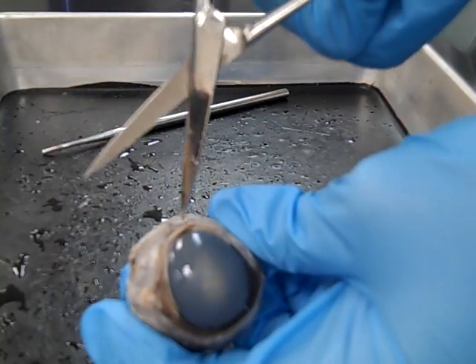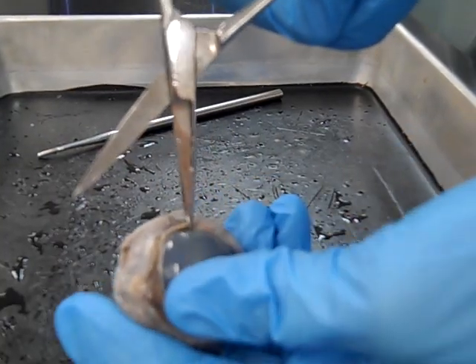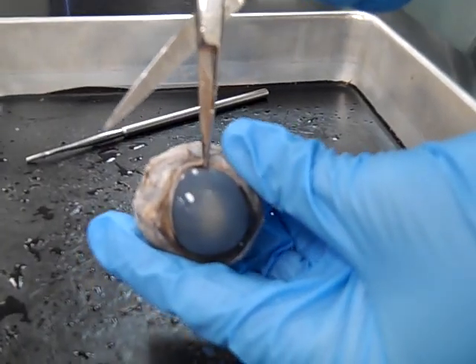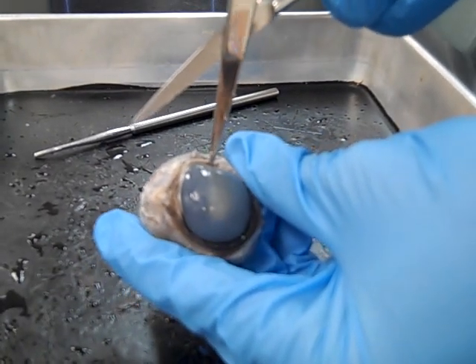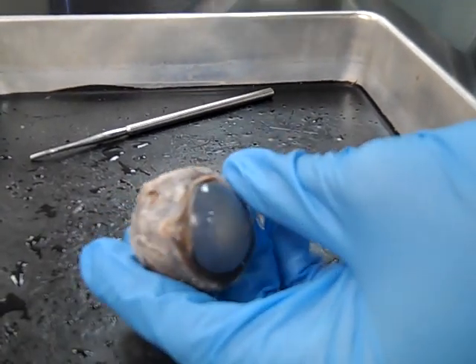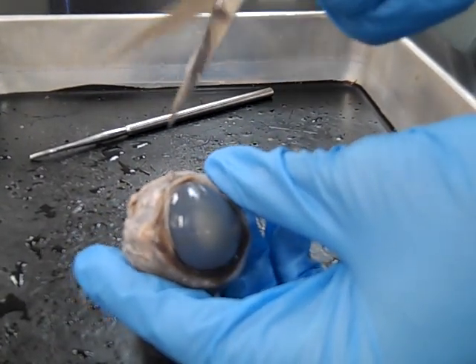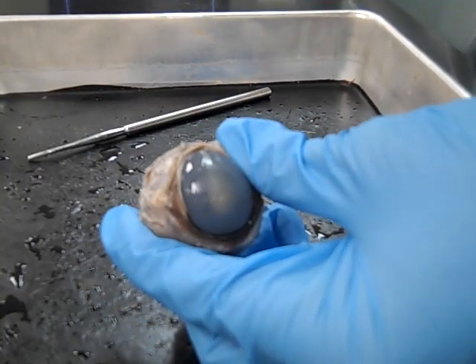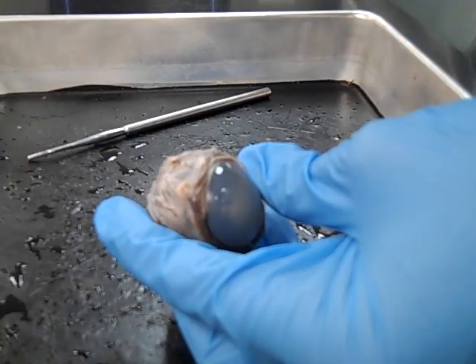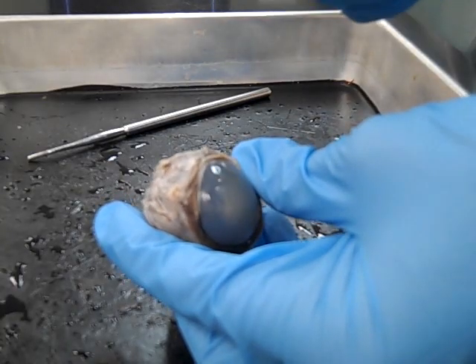Our first incision is going to be between the cornea and the sclera. We need to gently puncture the eyeball. Be aware the contents of the eyeball are under pressure. In the front there is the aqueous humor; in the back of the eye there is the vitreous humor. These are under pressure. If you pop this and squeeze the eye, it will spray humor everywhere. Trust me, there's nothing funny about getting covered with humor.